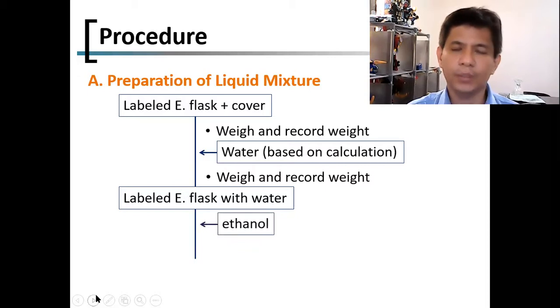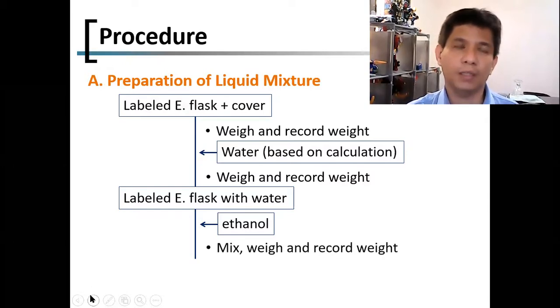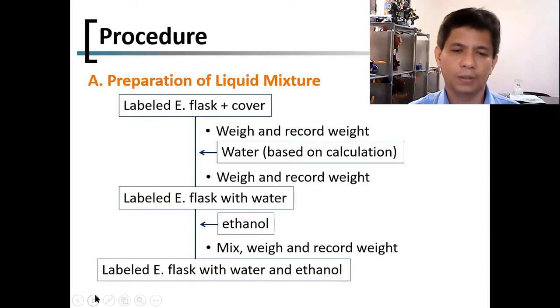Then we're going to add ethanol, a specific amount of ethanol. You're going to see the table later. For example, if you add 5 ml of water, next you're going to add 20 ml of ethanol. And then the next solution will contain 10 ml of water and then 15 ml of ethanol. It's approximately 25 ml in total. And then again, you're going to weigh this and record the weight. Basically, the Erlenmeyer flask now contains water and ethanol. I hope you can follow. And then you have the weight of the flask with water and ethanol.